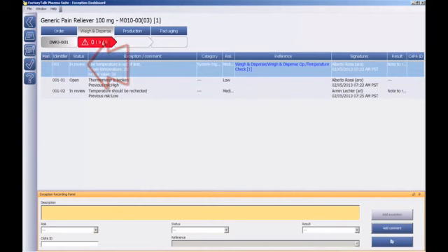The important feature to be emphasized is that the batch record review and the related exception handling can be in real time, in parallel with the process execution.